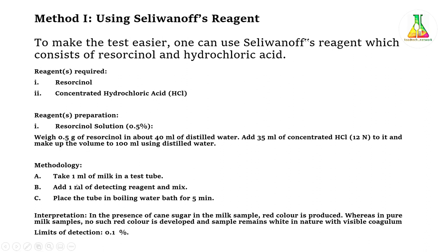Now we will take a clean, sterile test tube and add a specific amount of milk — about 1 ml. The milk temperature should not be less than 37 degrees Celsius; incubate it to reach room temperature. Then add 1 ml of the resorcinol solution, which is our detecting reagent. Mix it and place in a water bath for about 5 minutes. This will tell us whether the milk is adulterated with cane sugar or not.